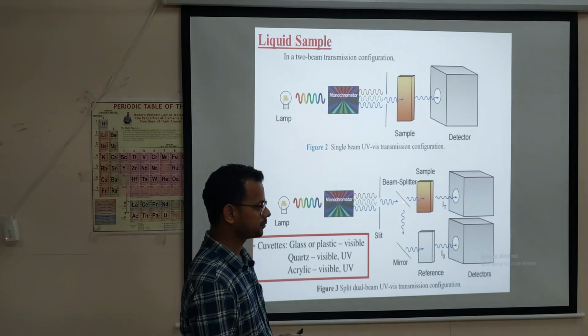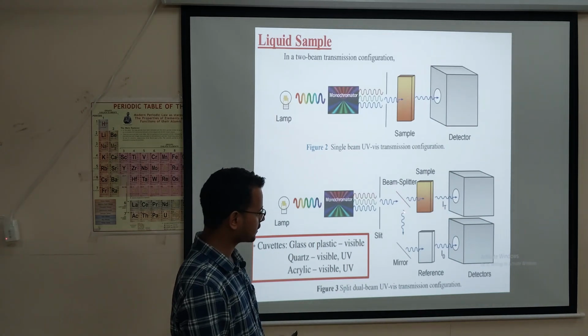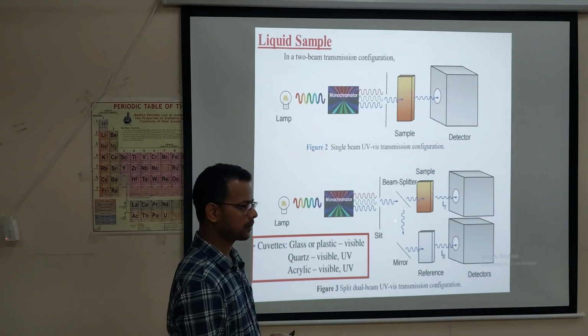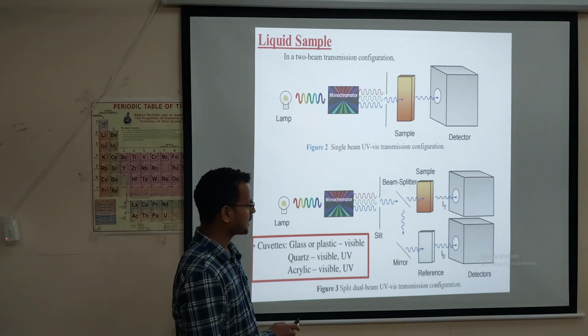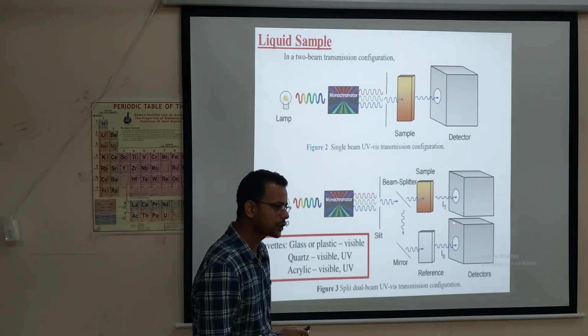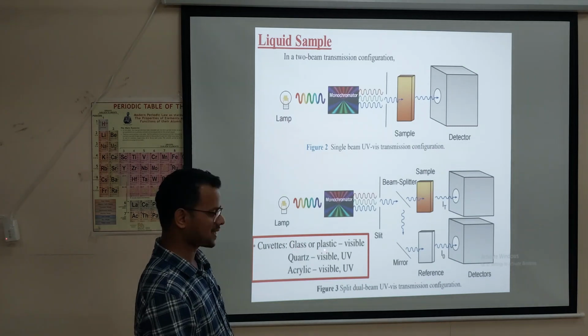This is a rotating mirror. Sometimes it passes this one, and while the position is like this, it reflects the light in this direction and it moves in this direction. This is a rotating mirror, right? And this is known as a cuvette. Here I have written cuvette, right? Cuvette may be glass or plastic.